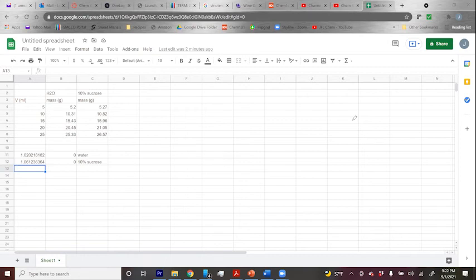As long as I report that there was a little bit of discrepancy, then it should be fine. That's perfect, that's as good as it gets. You have one more grain of sugar than you should. That's really accurate. I've spent so long trying to get it to exactly 5.50, and now that I hear this, I'm so sad.